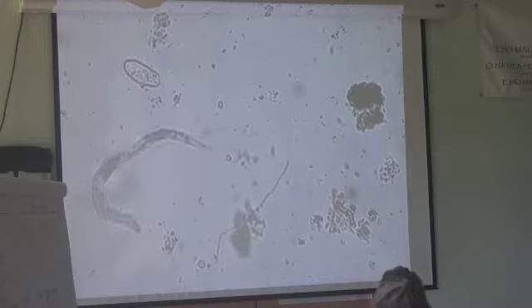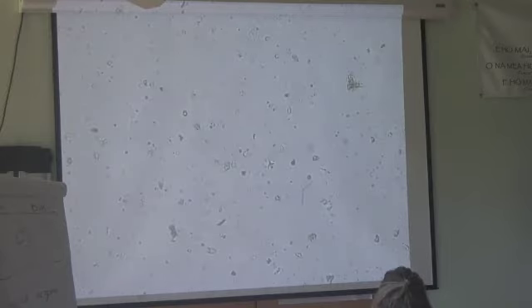But let's go on back to our 4x. See if we don't have some other nematodes in here. They're not waking up so much. Yeah, there's a flagellum, because he's happy bumbling. But you have just upset him with the light, and he's quite extra wiggly. I think so. If we come back, I don't think he's going to calm down anytime in the near future. He doesn't like the fact that his whole world has been shaken.